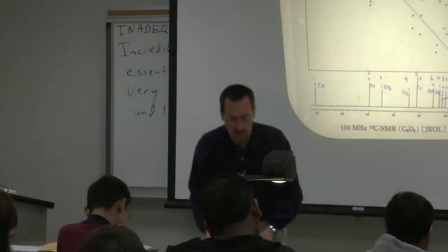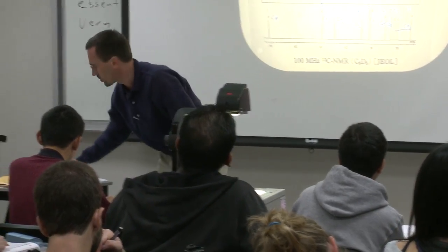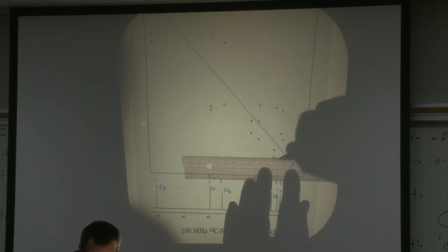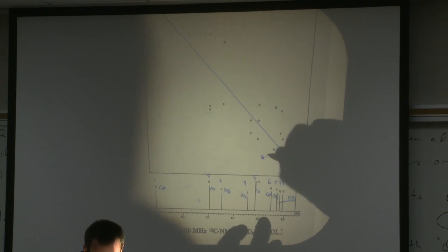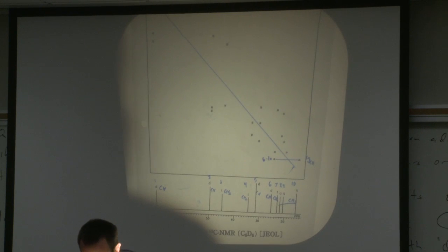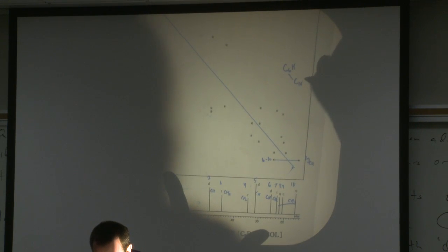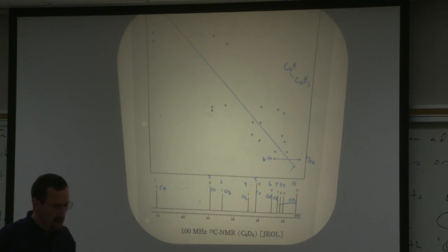All right, so let's start to build up our structure, and we can do so very mechanically. I'm just going to trace my pairs, and you can start anywhere. I'll just start here, and we'll get our cross peaks. And so this pair becomes 6 to 10. Okay, so 6 is a methine, so I'll draw that as C6H, and it's coupled to C10H3. So we're well on our way to building up our structure.